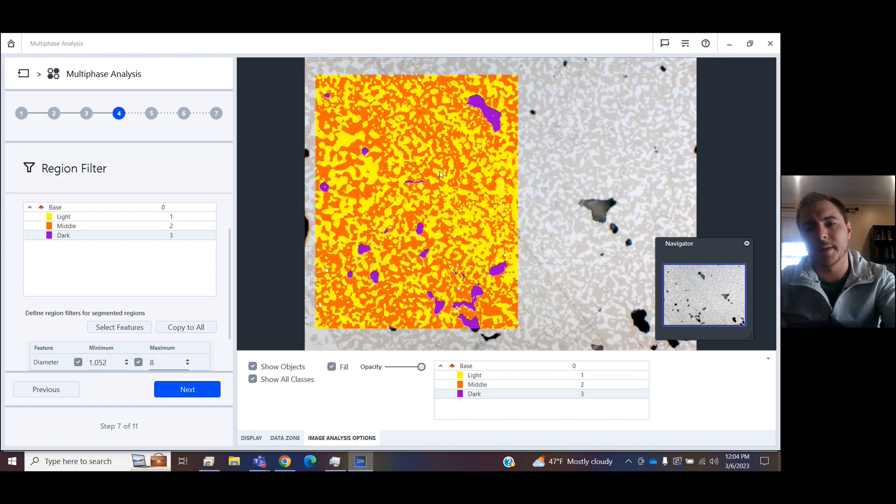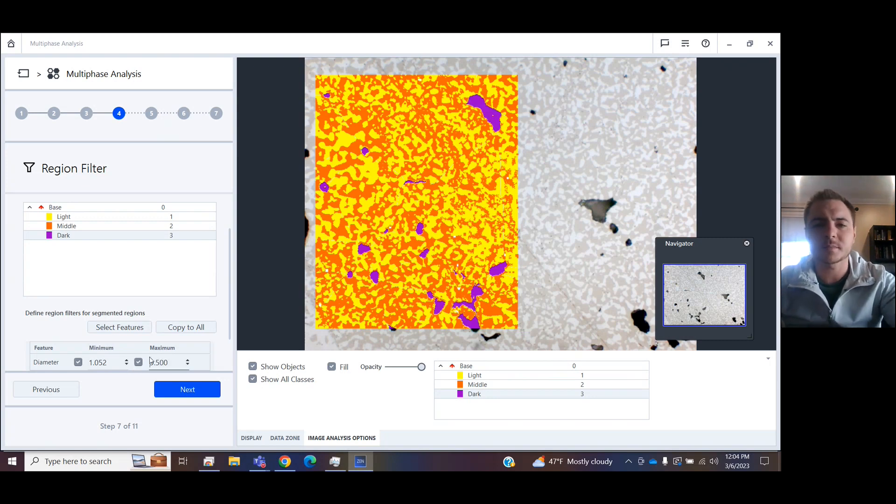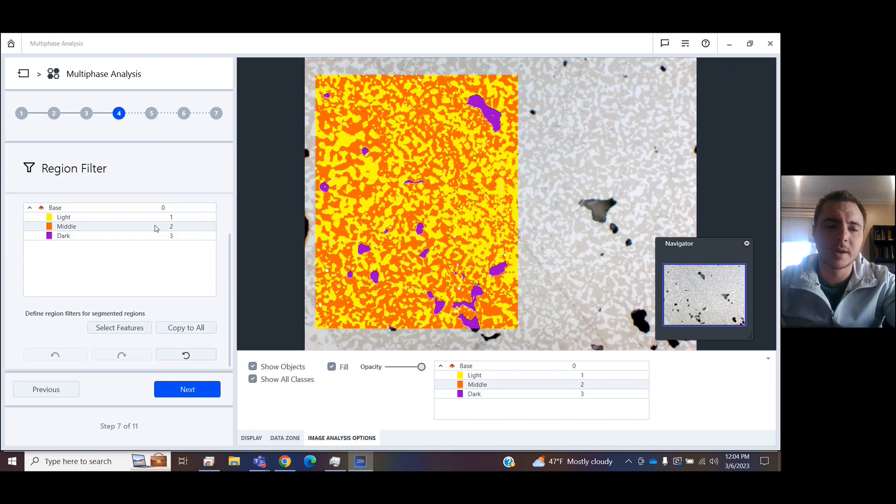If I made this maximum 8, we're going to watch this piece up here in the top right disappear. So now I might decide that I want it to be 9.5, so we include these.